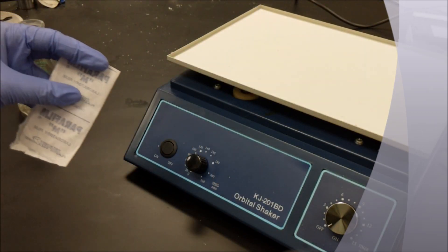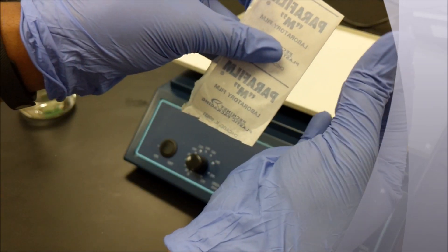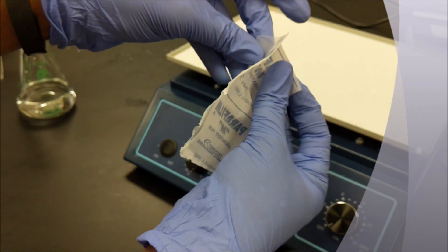To separate the parafilm from the paper, simply rub the strip between your thumb and index finger.